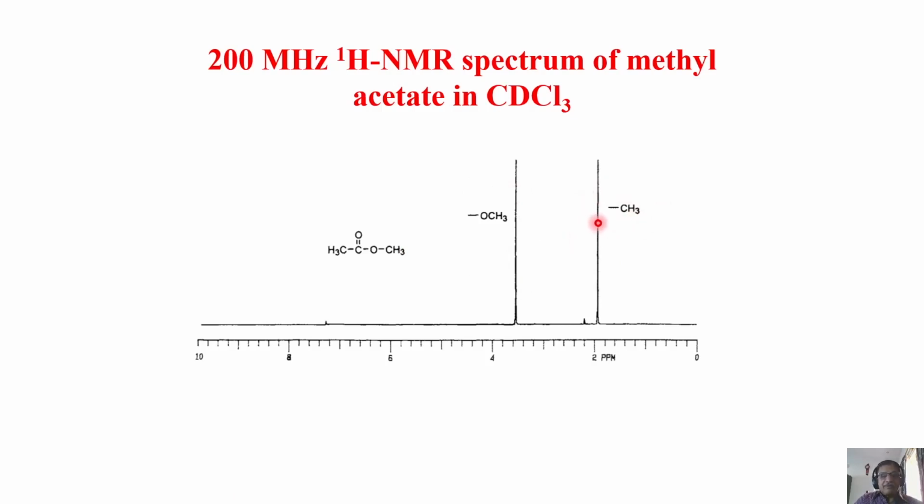So when you want to analyze the spectrum, as we go ahead, I'll tell you that you have to consider the height of the peaks also. I took the special example of this because both are CH3 groups containing an equal number of protons, so they have the same height, but the substituent has a different effect on one of the CH3s and brings it to downfield.